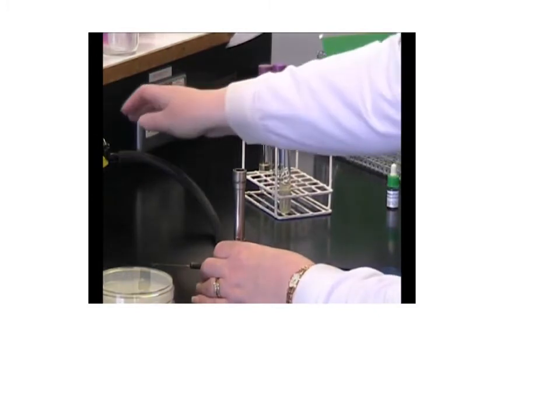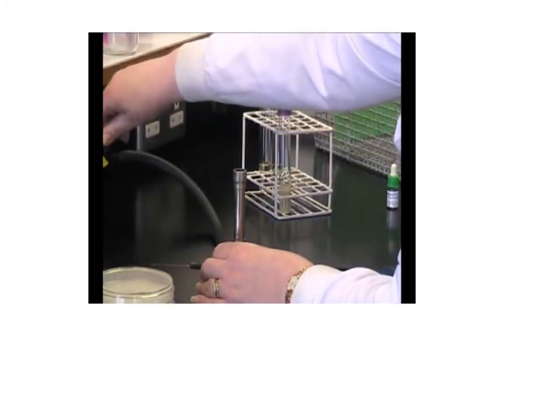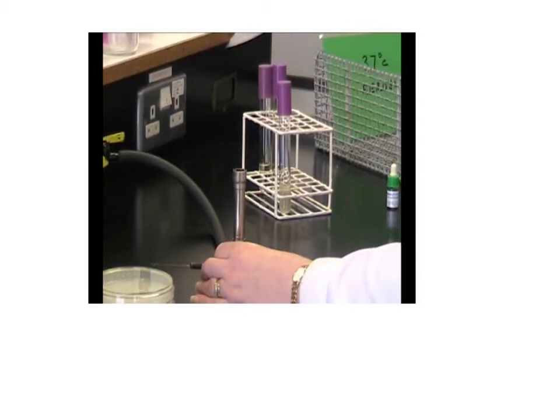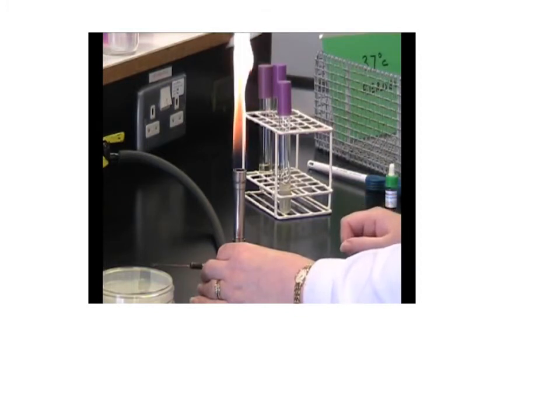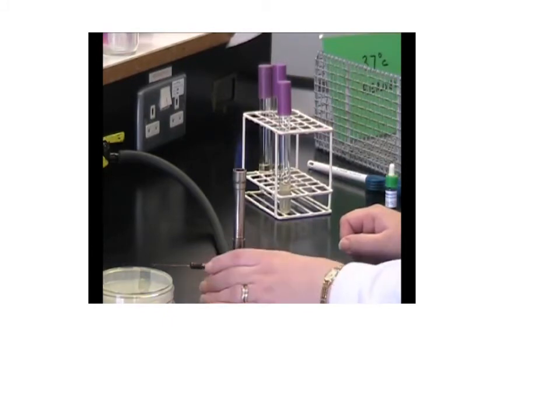diluting out the bacteria till you get single cells on the surface of the agar. These single cells will then each grow up when incubated to produce an isolated colony. These single isolated colonies are all derived from one cell, so you're working with a clone or pure culture. In this video you'll learn how to streak out bacteria and work aseptically. First, light your Bunsen burner. Turn on the gas, make sure the air hole is closed, and use the gas lighter. When the air hole is closed, the flame will be cold and yellow.